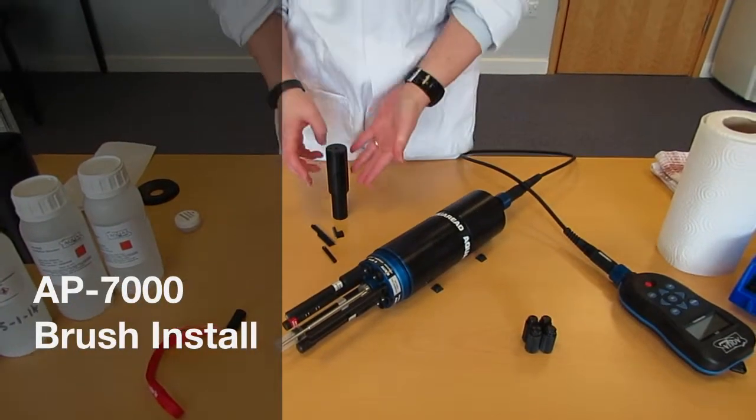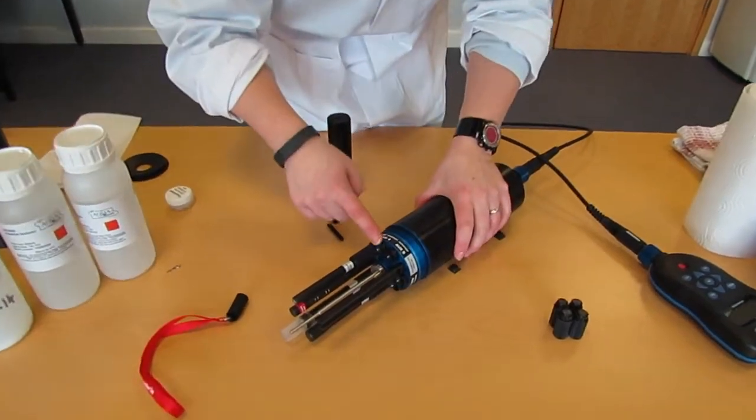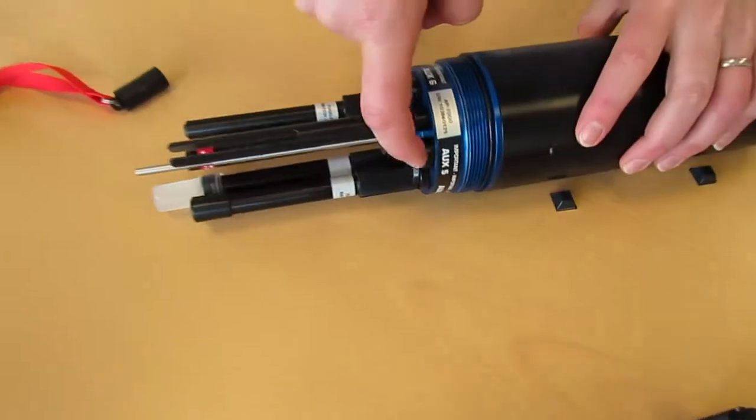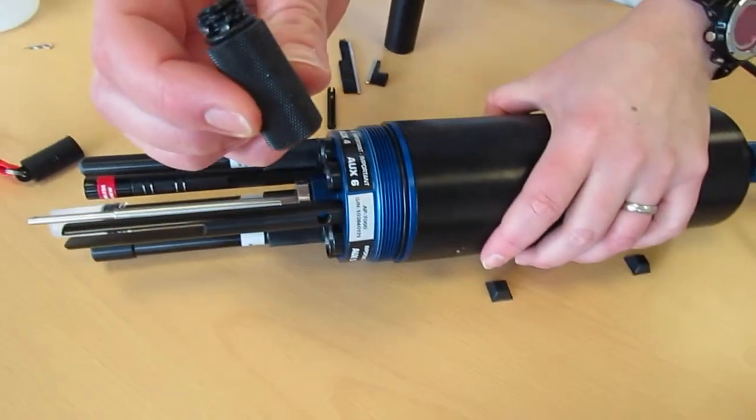So next I'm going to show you installation of the wiper arm. Now first of all, if we're not using these extra AUX electrode sockets, we need to plug them up with these plugs.